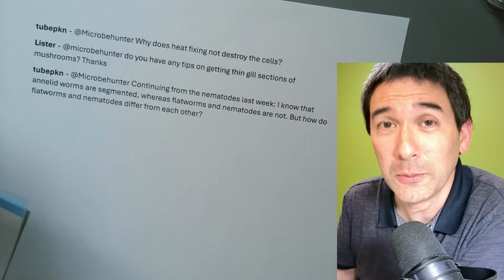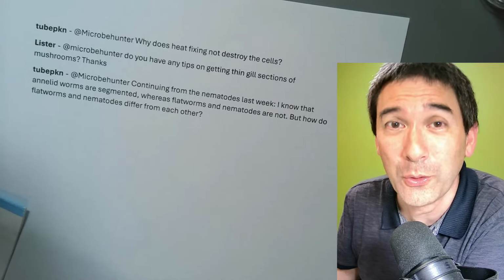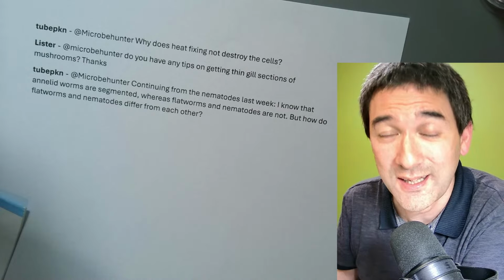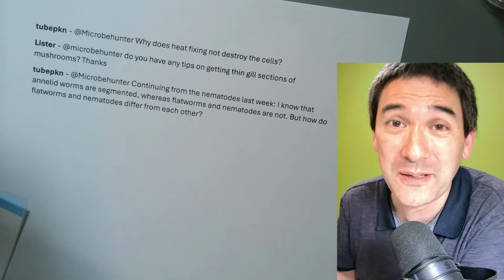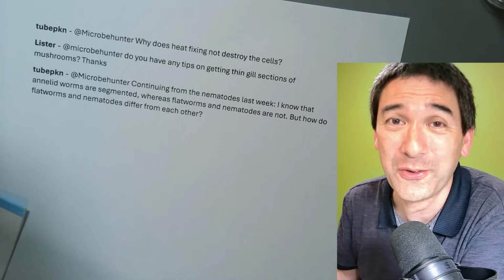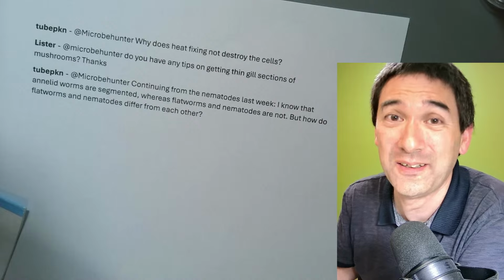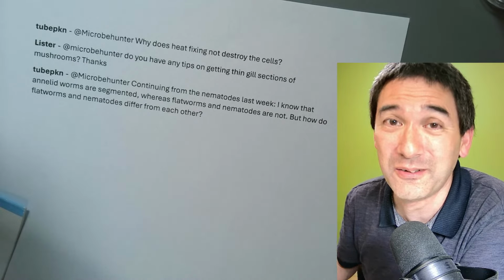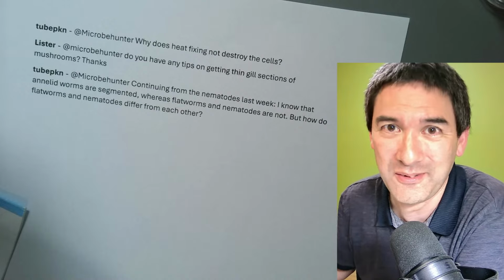But the problem is that if I now make grape juice and put it under the microscope, I'm going to see way more grape cells than I'm going to see bacteria. No, than I'm going to see the yeasts. So identifying those yeasts from a natural environment is a difficult thing, because they're often at a lower concentration than the other cells that you've got there.